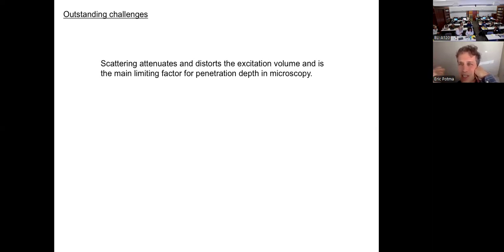But it doesn't mean that we have really succeeded at what we want to do, because all of the things that I talked about require you to make a nice focus somewhere deep in the tissue. That becomes increasingly more difficult as you go deeper because of light scattering. If the light scatters on the way in, you don't have the opportunity to make a nice confined focus, which is what you need to generate these signals. So light scattering in tissues is one of the major limitations. It limits the quality of the signal, the intensity, the resolution, and ultimately it puts a hard stop to how far you can push this.